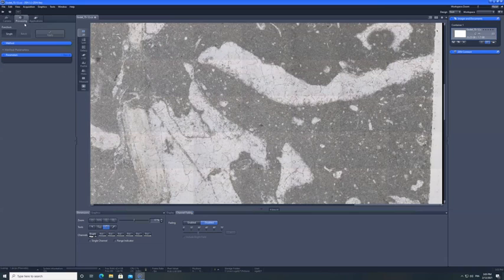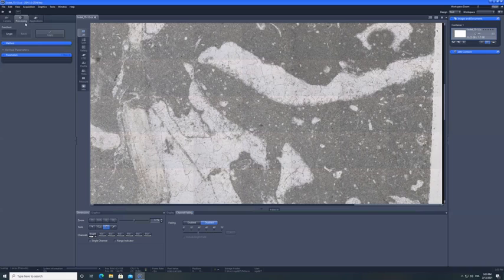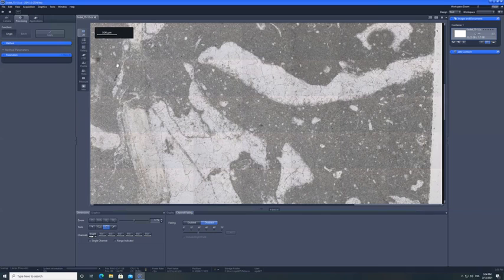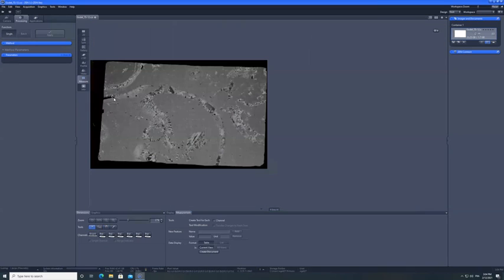So this is the scale bar using the Zeiss Zen software. I believe there should be a way to measure things out. Here we go. This is the scale bar.